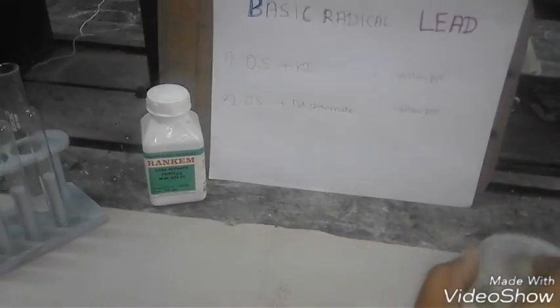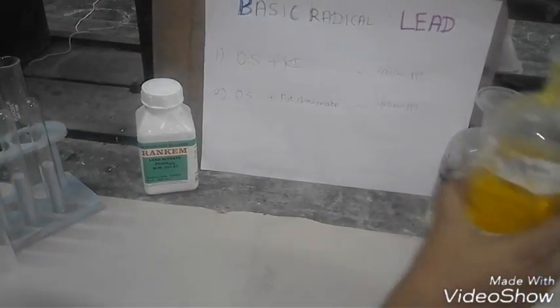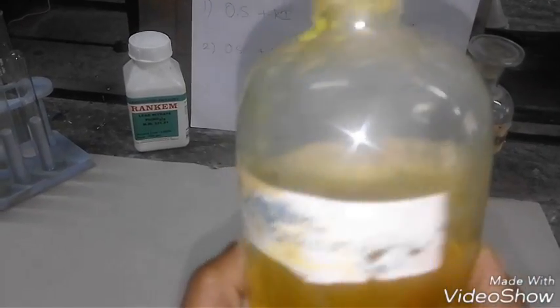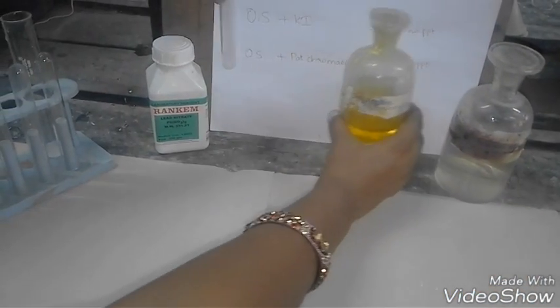Here is the second test tube for the confirmatory test for lead. To a small amount of original solution, potassium chromate is added. Potassium chromate itself is a yellow liquid.